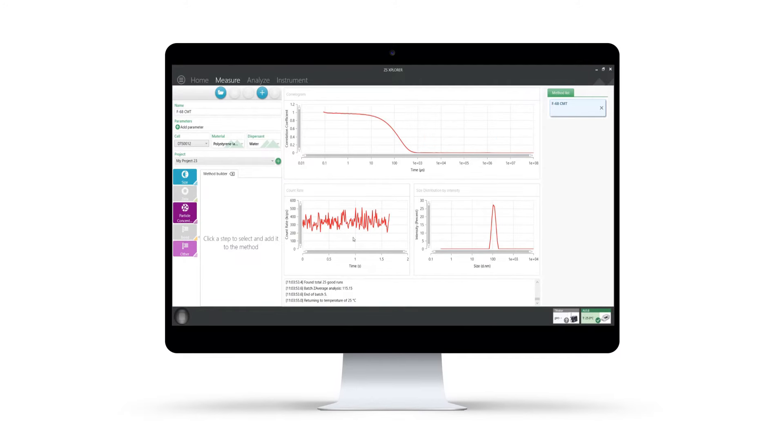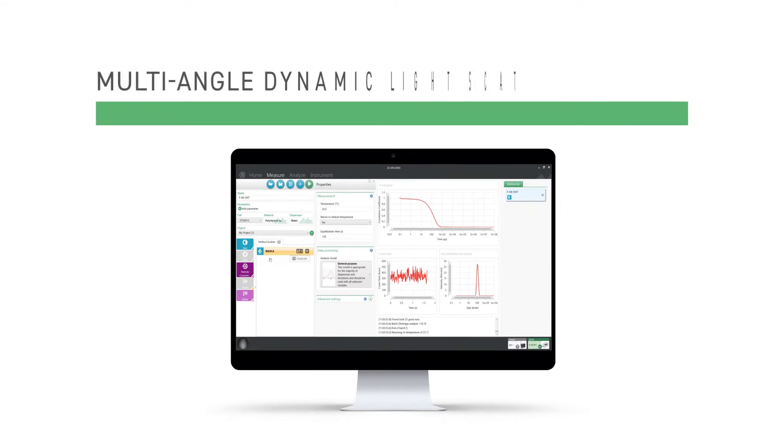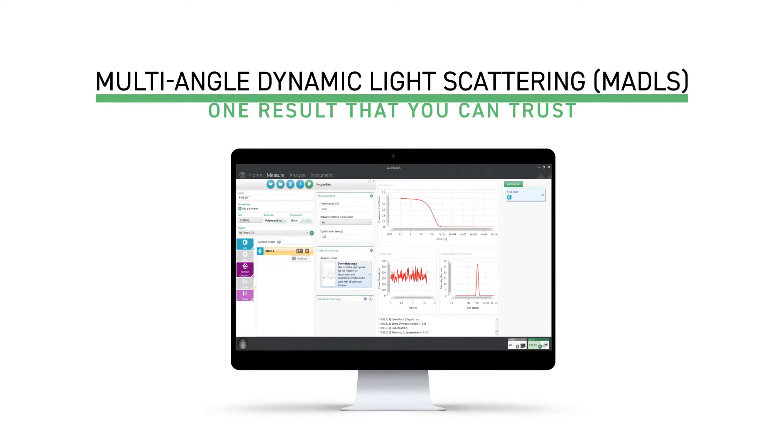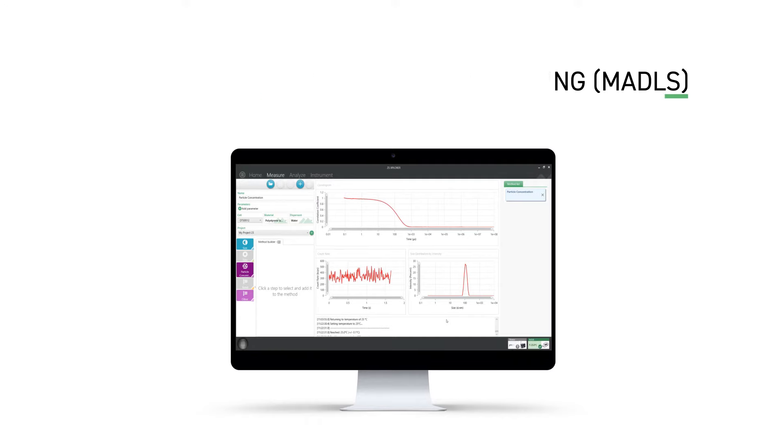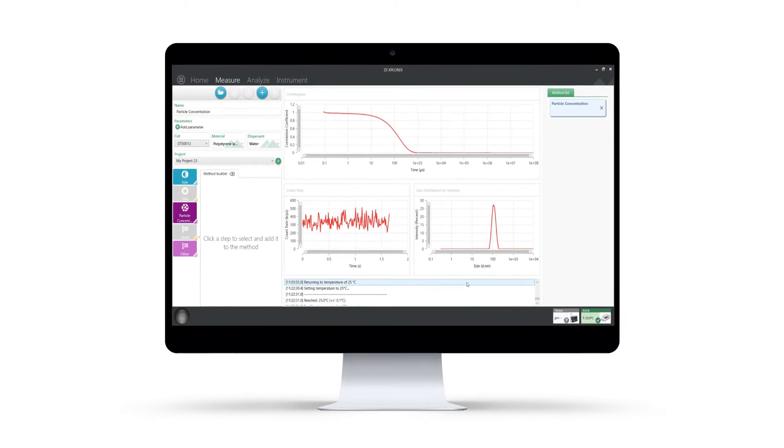The ZetaSizer Ultra also employs a new measurement protocol called multi-angle dynamic light scattering, or MADLS for short. MADLS combines data from three measurement angles to resolve any hidden size populations and give a single particle size result that you can trust.